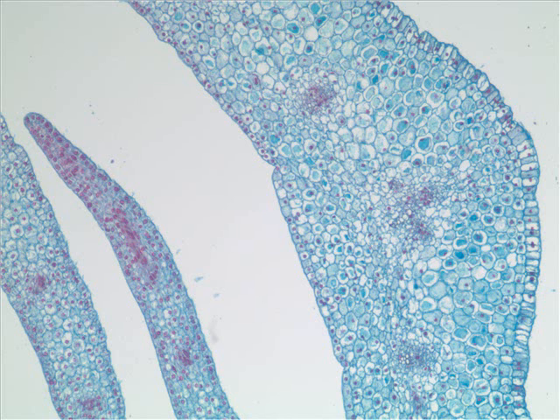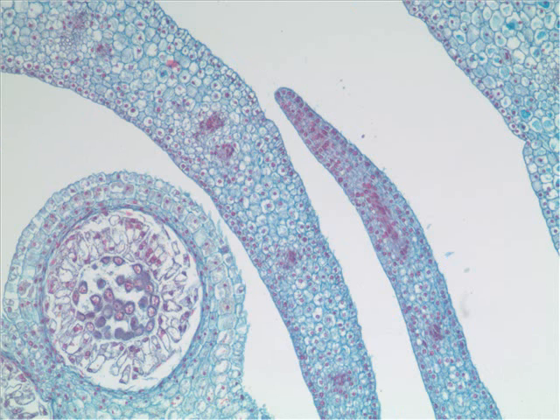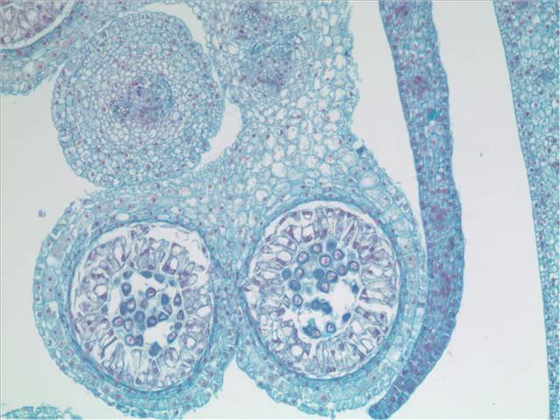And now we have our cross-sectional view of a lily. And so this is the very outside. What is that? A sepal. What are these two things to the lower left? Those are two baby petals, overlapping baby petals, yes. And so to the upper right we have a sepal, then two petals, parts of two petals. And then we see what peeking at us here? Part of a what? An anther, that's correct.